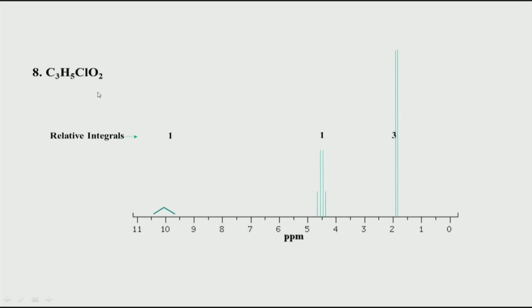Similarly, mass spec will give you the same mass for both systems, so a regular mass spectrum will not help in deciding whether it is an isomer or not. So, NMR is a unique, nice technique where you can differentiate two structural isomers from each other.